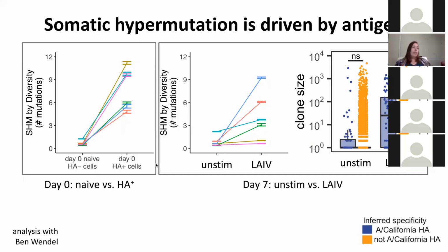If we look at the organoids produced from those naive cultures, which essentially had 0 mutations at the beginning, you can see in unstimulated cultures, they largely remain unmutated, as you would expect. If we look at flu-stimulated cultures, however, we see an increase in mutations. So that suggests to us that the B cells with at least low affinity from the naive pool that were capable of responding to the flu vaccine that we provided are increasing their mutations to gain affinity for LAIV.